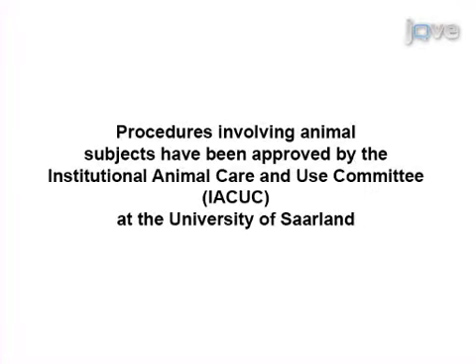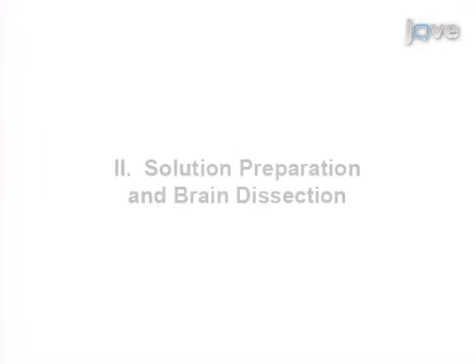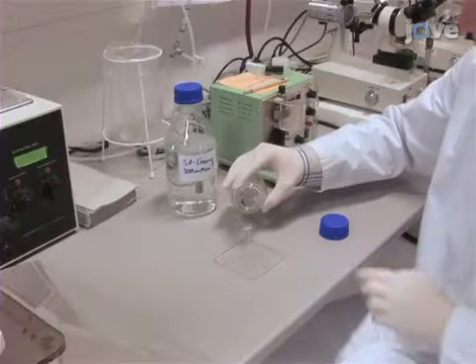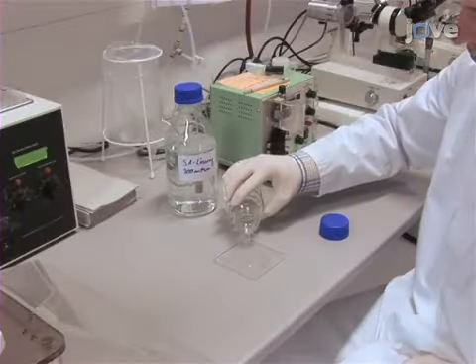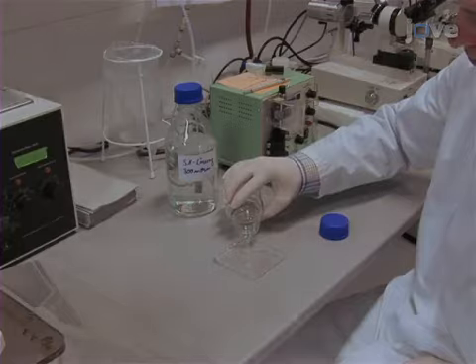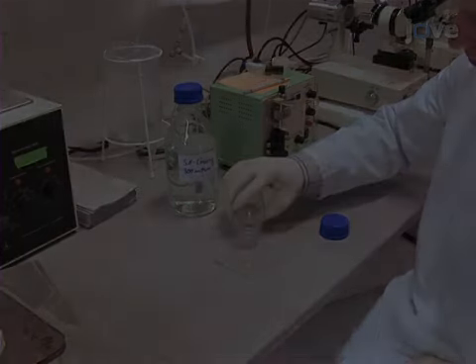Begin the procedure by pouring the heated agar solution into a mold.